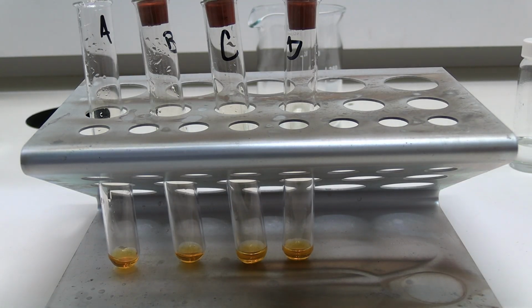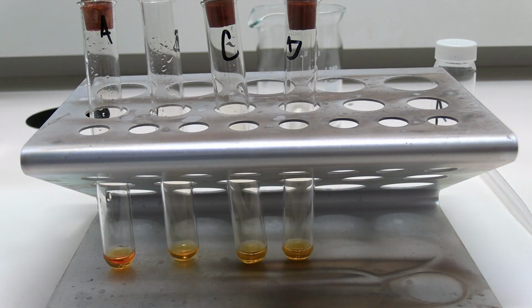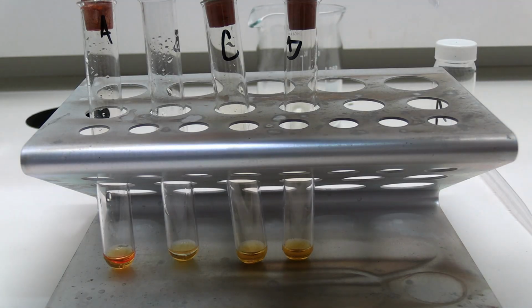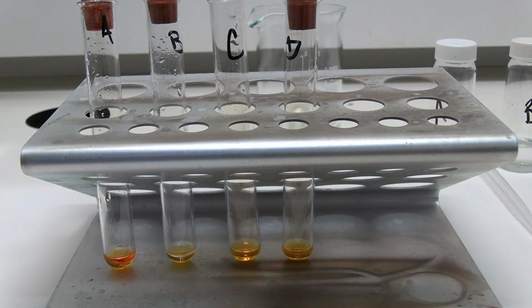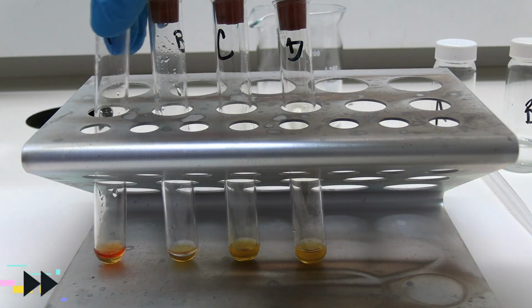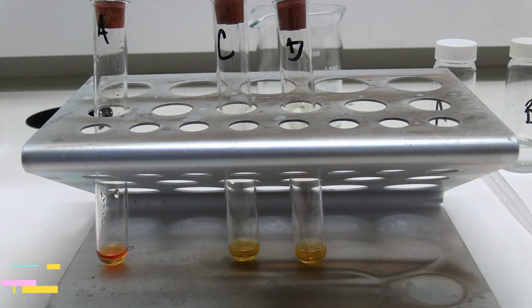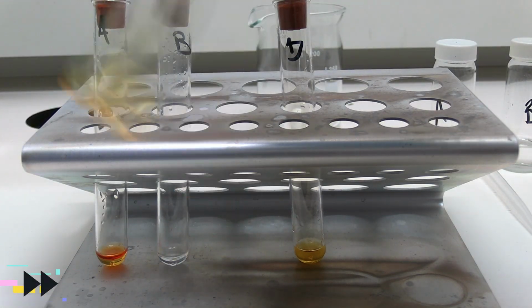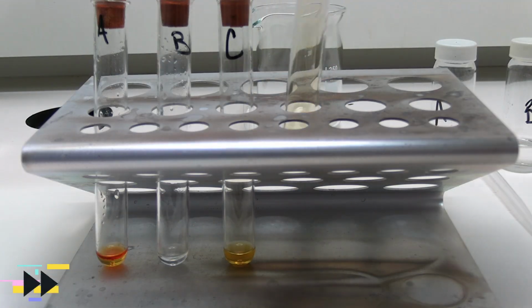You'll then add just a few drops of your samples to their corresponding test tubes. Just as before, making sure to cover them again after each addition. Once complete, give each test tube a shake and record your observations. If the bromine water changes color from orange to colorless, then it's an alkene.